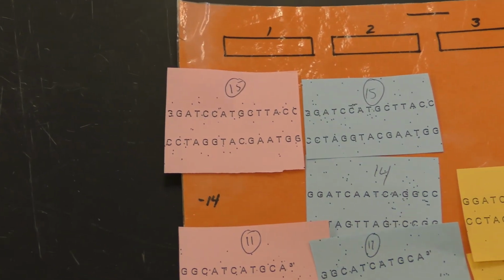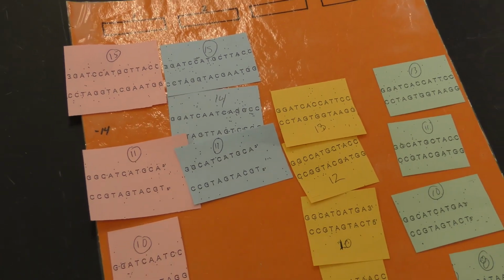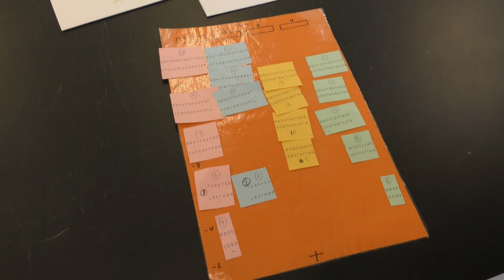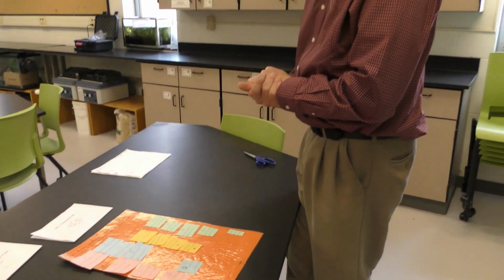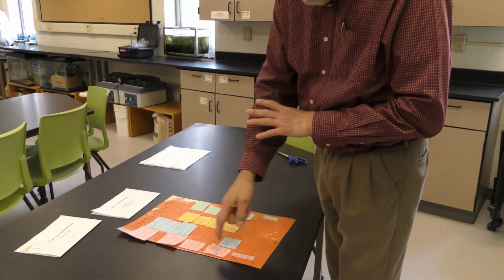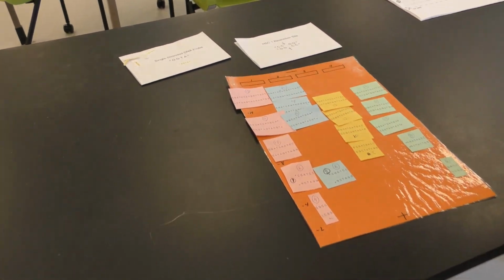But after we did the experiment, this is what we ran on the gel, and this is how the fragments separated themselves in the gel. Okay, so there's some questions in your lab manual you can answer about this. Using this simple DNA fingerprinting technique, can you differentiate, for example, between DNA 1 and 2? Well, you can say, yes, I can, because we generated 5 fragments for DNA 1, and after a simple mutation in DNA 2, we've only generated 4 fragments.